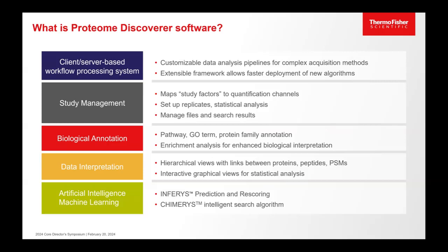So Proteome Discoverer is not a search engine. Proteome Discoverer is a system that allows us to put search engines in it, but also filters, PTM analysis, FDR algorithms, and so forth.